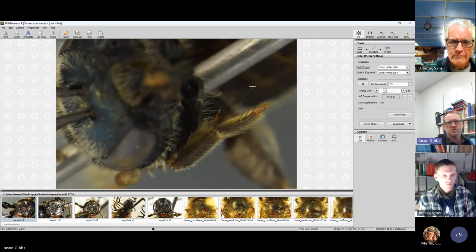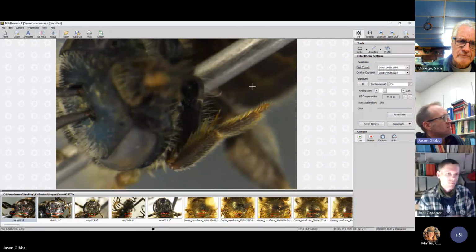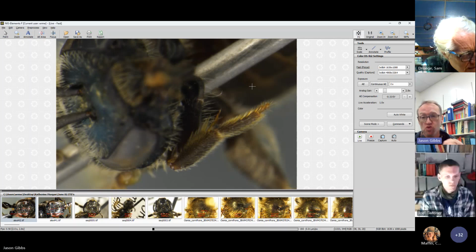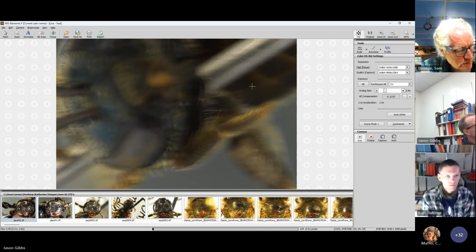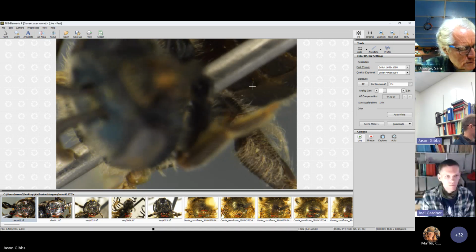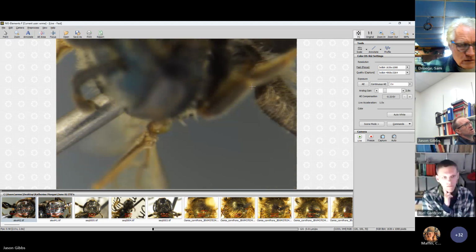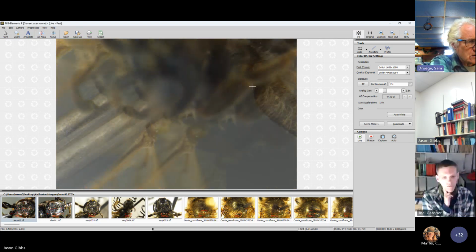This is connexum, and I was telling Sam before the workshop started that it's like callidum on steroids. So if callidum has a wide front trochanter, connexum is really wide. And I think it's a little clearer on my camera, because it's kind of coming from a different ocular than what I see in the camera. Oops. It's a little dark.